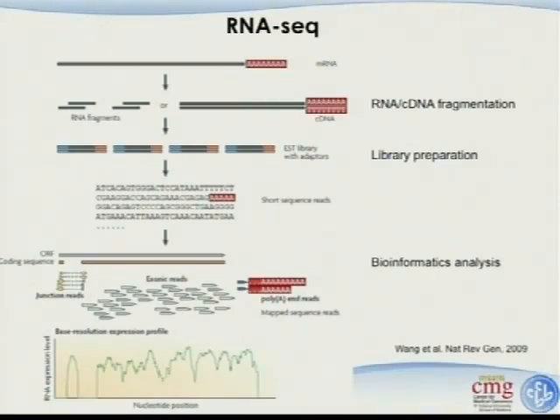So it sounds pretty simple, but you know that for each individual step, both the biochemistry part and the bioinformatics part can be pretty annoying. Okay, but I'll give you a trick. As a biologist, what you do is you get total RNA, and you send that total RNA to GNAT, and GNAT will send the data to me. And then that's the end of it. So it's pretty straightforward if that's the case.